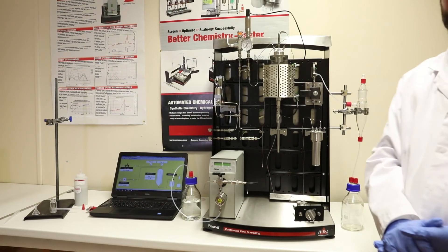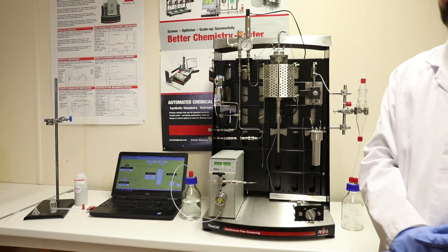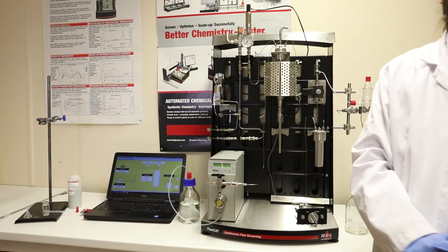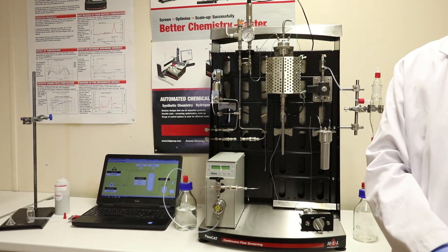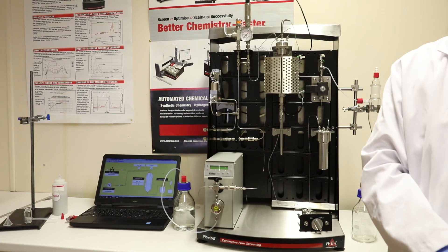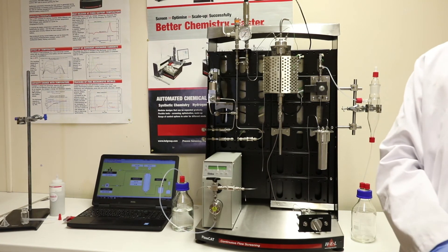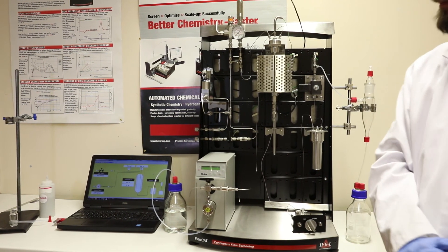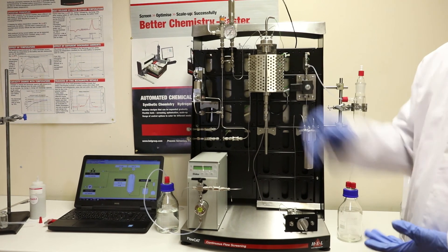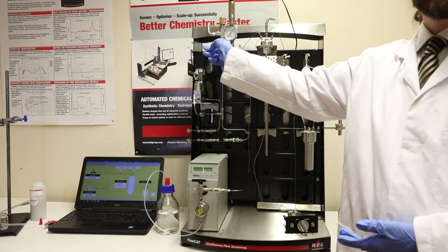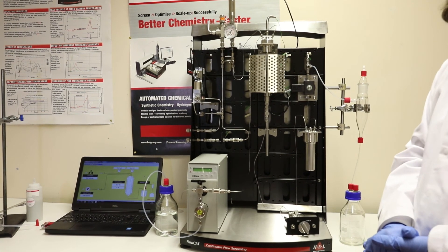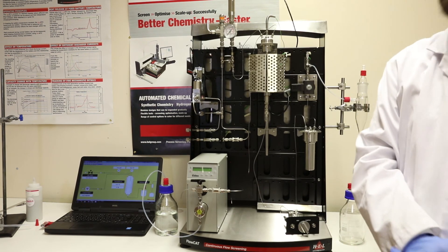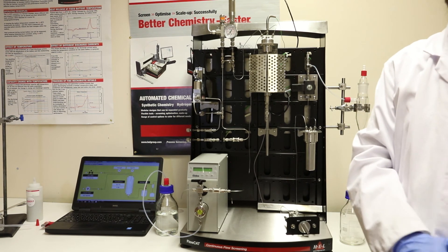Now I'd like to talk about the safety features on the system. Now the system, because it's a flow system, is intrinsically safer than a batch system would be of the same scale of production. At any given time, you only have a few milliliters of liquid and gas in the system, which makes it intrinsically safer, but it doesn't make it totally safe. We have a number of safety features on the system. We have these check valves, which prevent any back flushing into the feeds. We have electrical trips in the heater that prevent it overheating. We have a pressure relief valve here, which will vent if too much pressure builds up within the system. Here you can see the pipe is venting upwards. If you have particularly hazardous chemistry, you could route that through to either a dump tank, a scrubber, or a ventilation system.